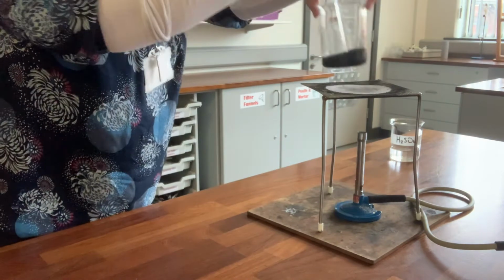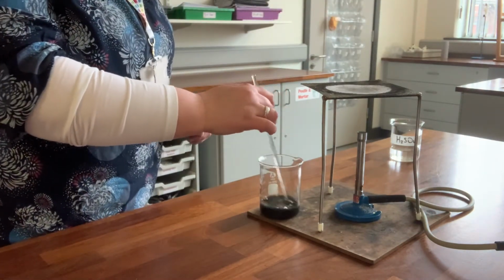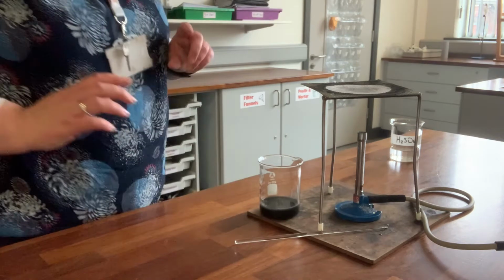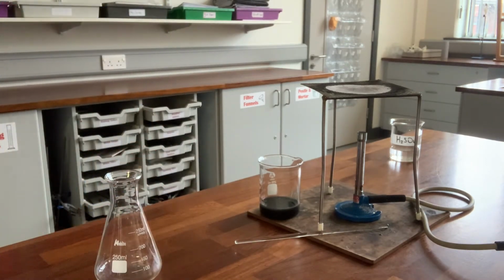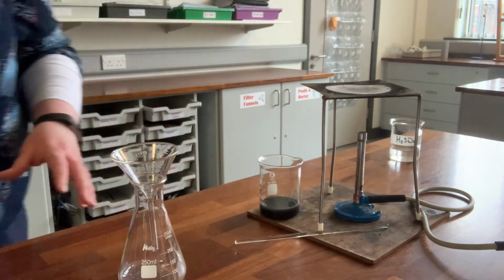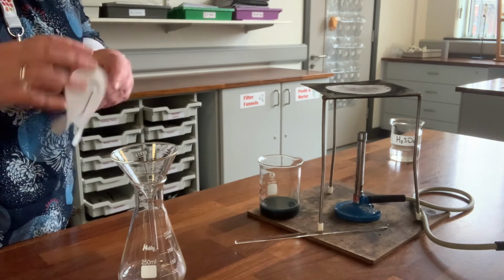So we just wanted to heat that up a tiny bit. We didn't want it to start to boil to get the acid fumes in the room. We only wanted a little bit. So what we need to do now is to get rid of the extra copper oxide that we have. So copper oxide is what's called a base, which means it will neutralize the acid, but it won't dissolve in the water. So we're going to have some solid copper oxide left behind.